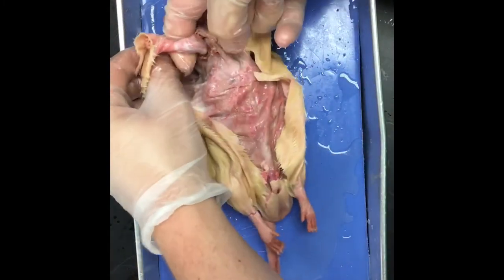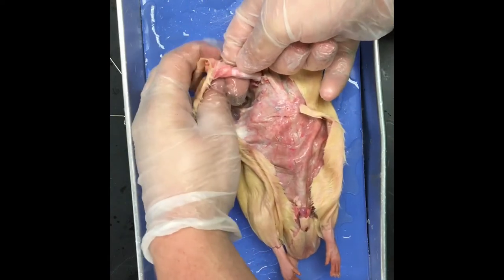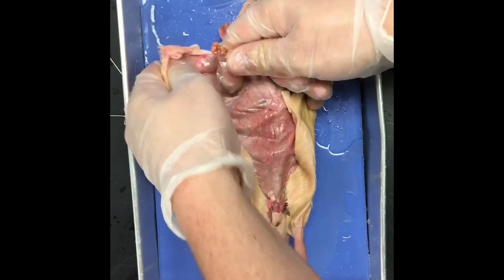All right, so you're going to get a spot to put your finger through behind here. This is what it looks like. Guys, pay attention. You're going to do what's called degloving. Boop. Here's a little paw.